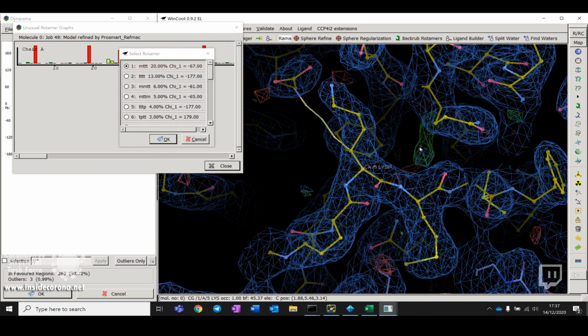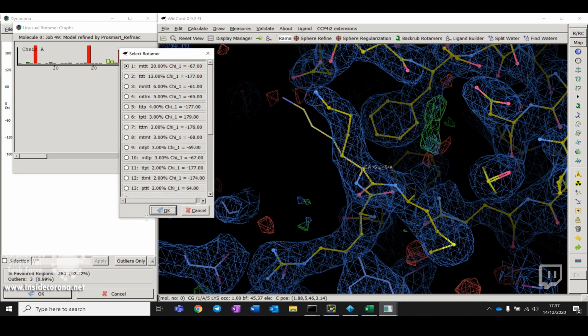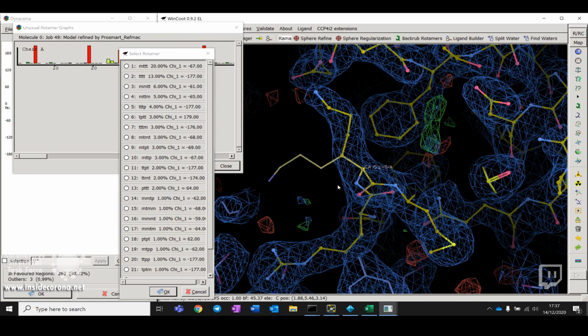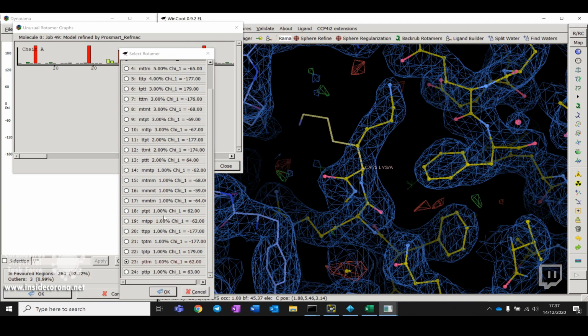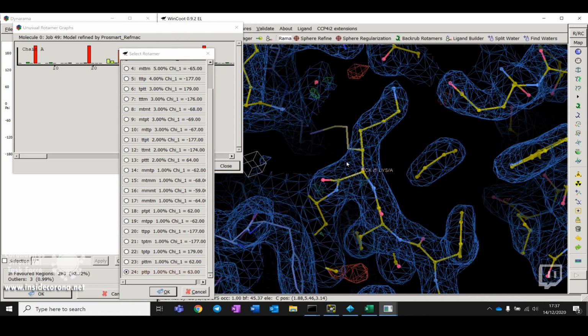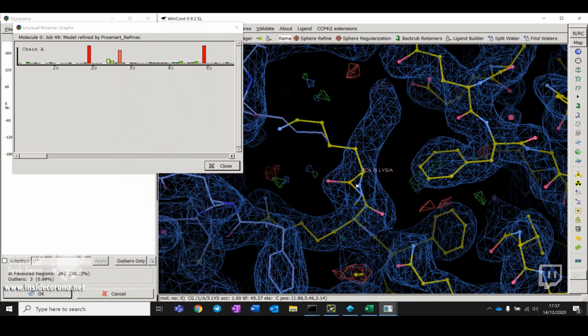There's a lot of ways they can be arranged, but we have a list of conformations in which the bond angles and lengths make sense. So we can flick through these and try and find one that fits better to the density that we've got. You can't always do this. Sometimes things adopt non-optimal conformers, and you just have to accept it.